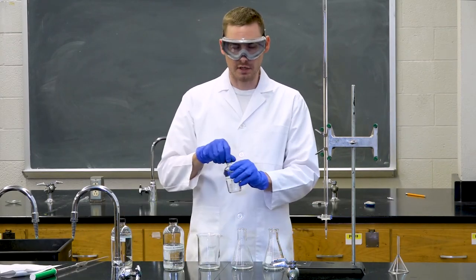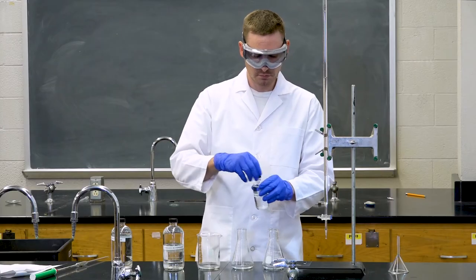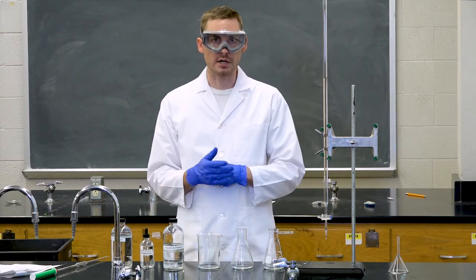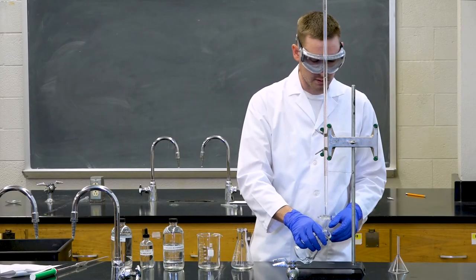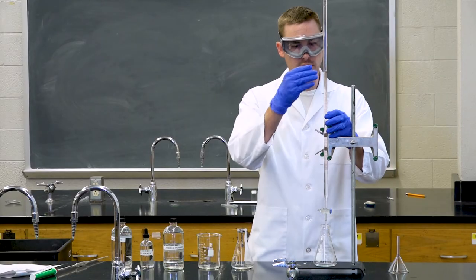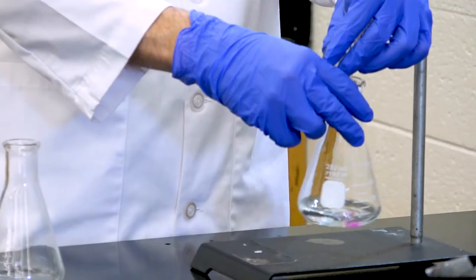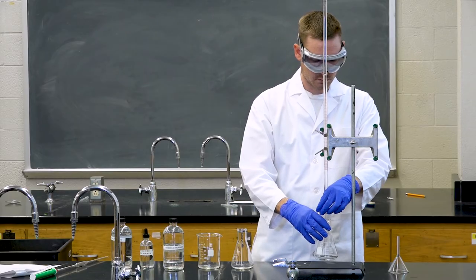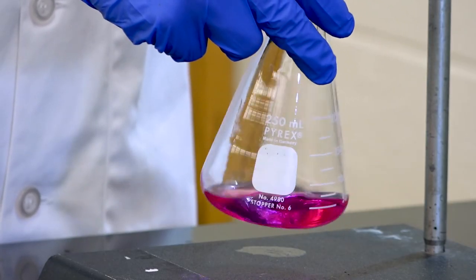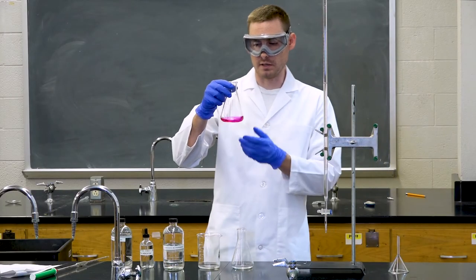Followed by 2 drops of our indicator. Before we start, we need to record the starting volume in our burette, and then once again, slowly add the solution in the burette to our Erlenmeyer flask drop-wise. We have now reached the end point of our titration.